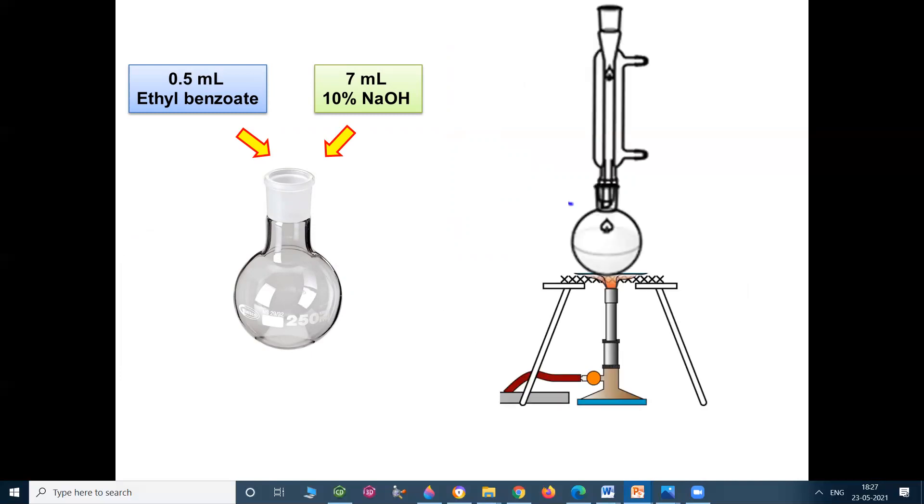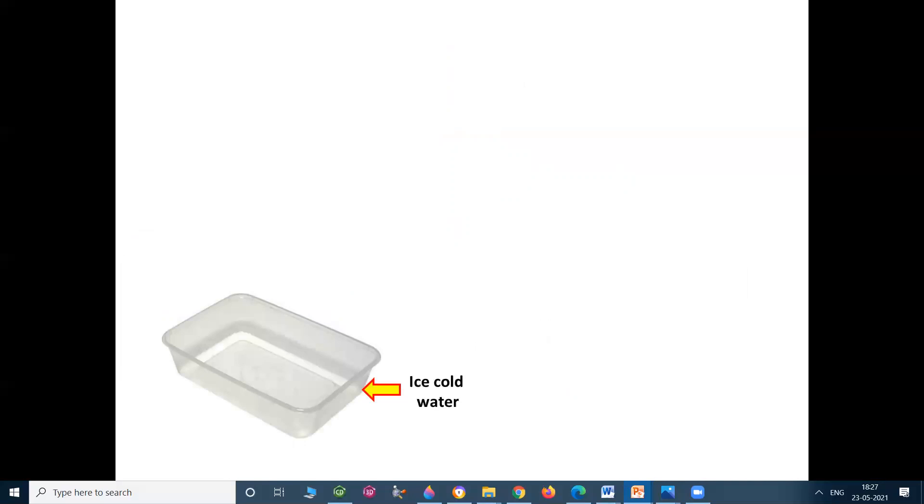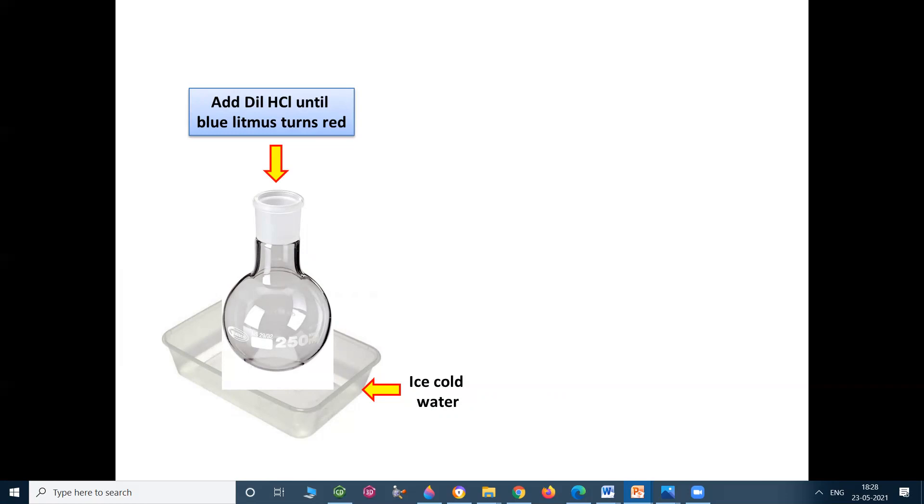Then reflux the solution until ethyl benzoate layer disappears. Then place the round bottom flask in ice cold water and add dilute HCl until blue litmus turns to red.